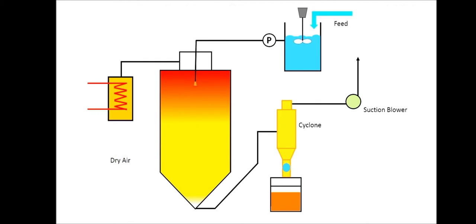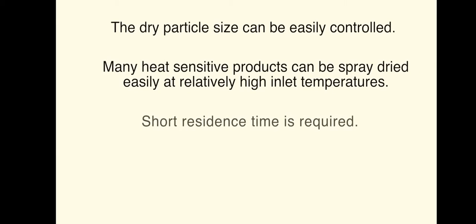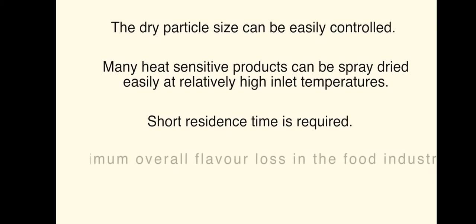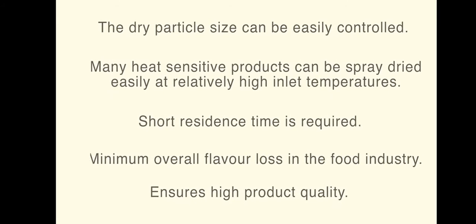blower. The advantages of spray dryer are, the dry particle size can be easily controlled. Many heat-sensitive products can be spray dried easily at relatively high inlet temperatures. Short residence time is required. Minimum overall flavor loss in the food industry. Lastly, it ensures high product quality.